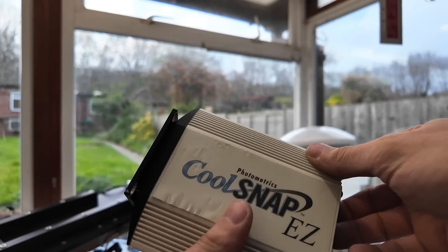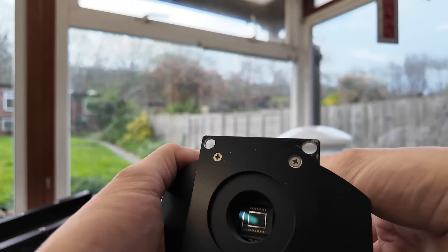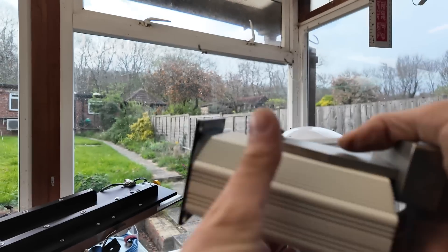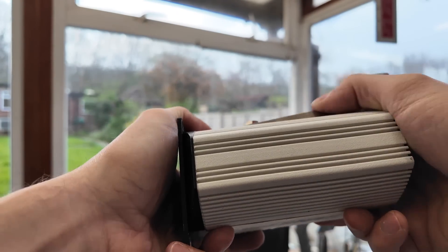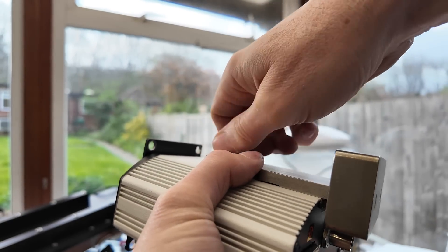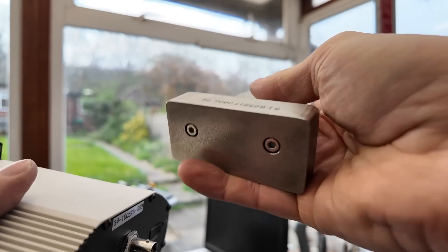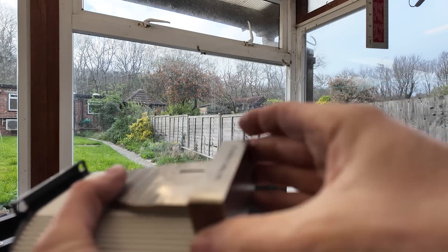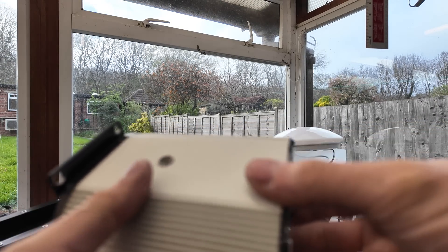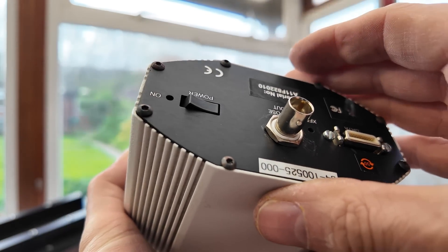Here's the camera — this is a Photometrics CoolSnap EZ, maybe about a half-inch sensor. One interesting little detail: it's got this weight attached to it. Obviously it's mounted on this face, and I wonder if without this there's some vibrational resonance in this direction. So they've just put a big chunk of weight onto it — this is really heavy, over half a kilo. But it literally doesn't attach to anything else — its only function could be as a weight. I can only assume it's either anti-vibration or maybe damping so that when the focus moves it's ready to take a photo more quickly. I've not seen anything like that before.